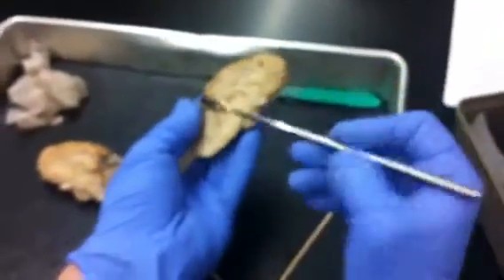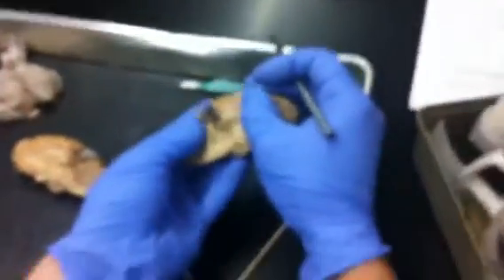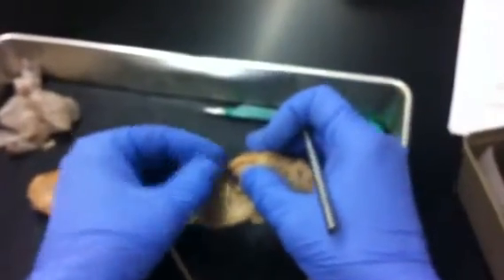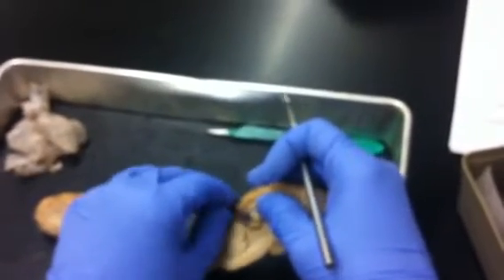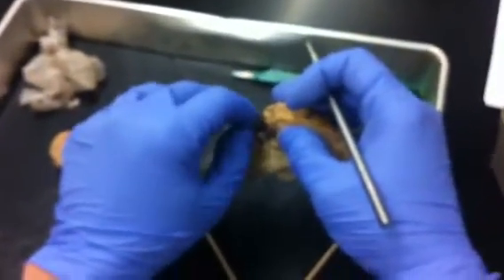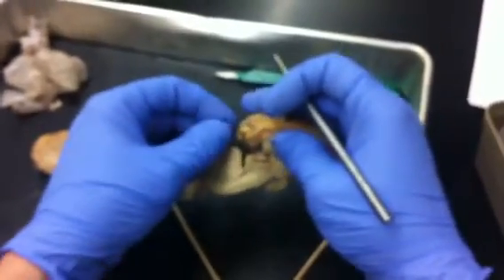Okay. Now, up here at the midbrain. In the midbrain, you want to look for your colliculi. Right? And you can see them right here and right there. It's a little bit easier to see if you pull this dura out of the way. And it's tough here because this is one of your dural folds. That's your tentorium cerebelli right there, which I'm not going to ask you to tell me on the practical.